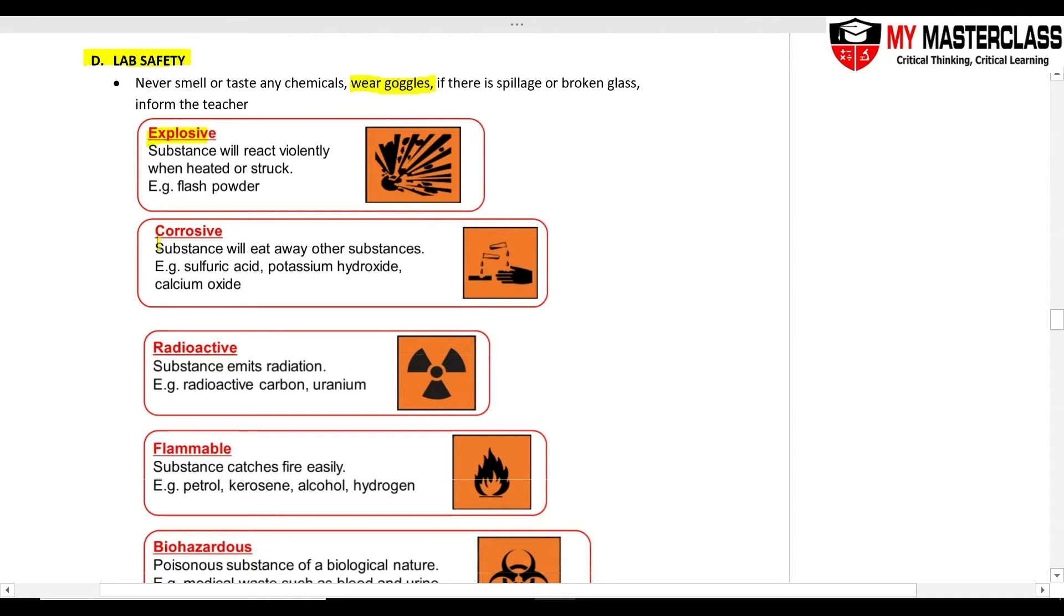Second one is corrosive. So substances that will corrupt your hand, you can see it's burning. Examples are your acids.